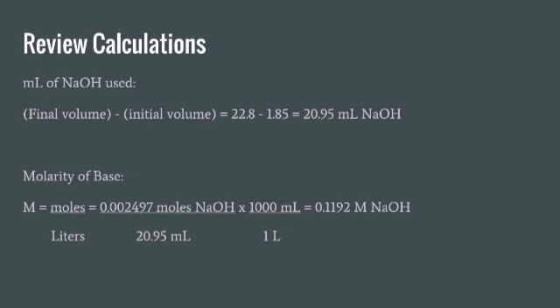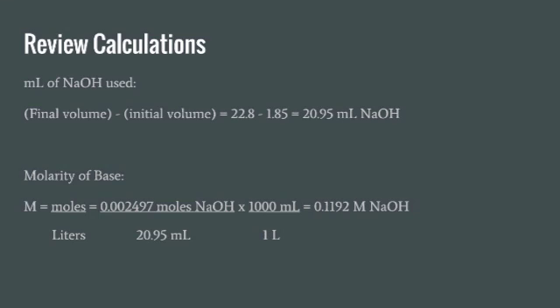And so I hope that shows how you can find the concentration of an unknown solution using a known solution. The known solution was the acid, and we just determined the concentration of the base to be 0.1192.